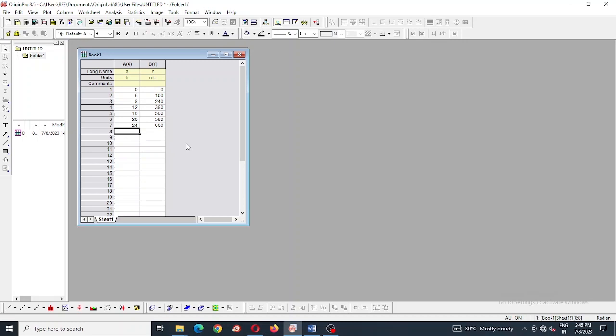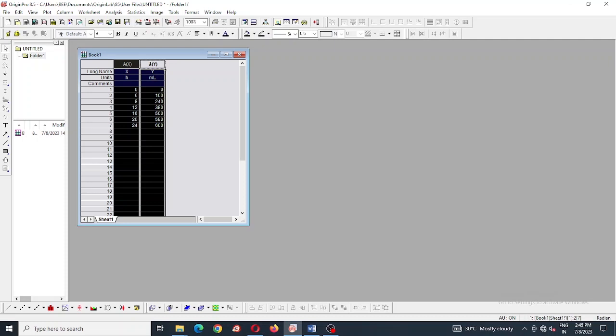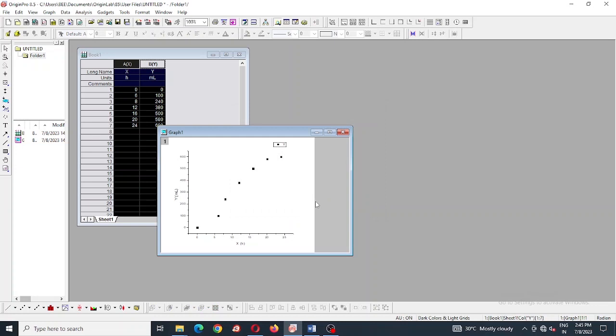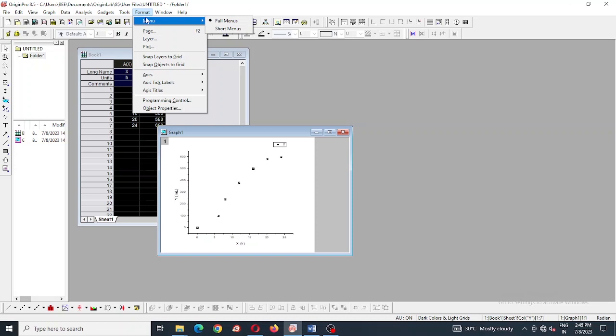We are creating the graph, with X axis from 0 to 24 hour, and Y axis is from 0 to 600. You can see this in excel sheet. After that, we created the scatter plot. Further we are going to add modified Gompertz equation for the curve fitting purpose.